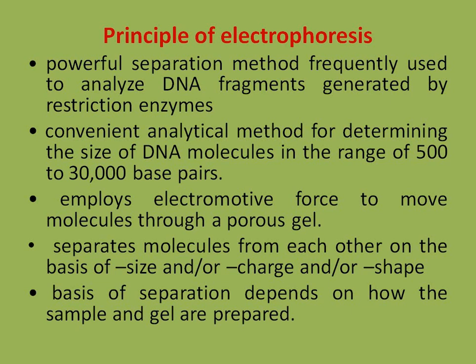Principle of electrophoresis: a powerful separation method frequently used to analyze DNA fragments generated by restriction enzymes. So it is a very powerful tool that can easily distinguish them, and noticeable differences can be observed while going for this restriction enzyme analysis.